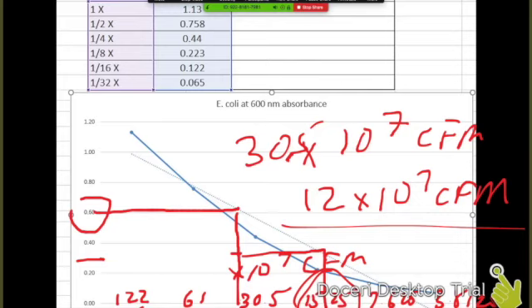So we'll be doing different temperatures of growth. So we'll be able to compare how well a sample grew at, say, 20 degrees Celsius versus 37 degrees Celsius, because we'll have real numbers, because all we have to do is take the absorbance, put the sample in the spectrophotometer, and then come out with the CFUs per mil based on this chart.